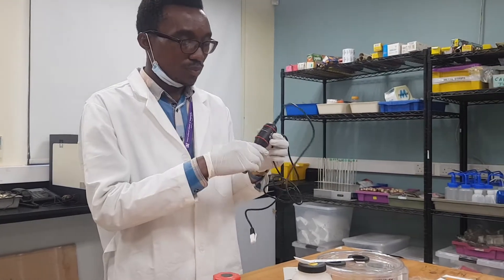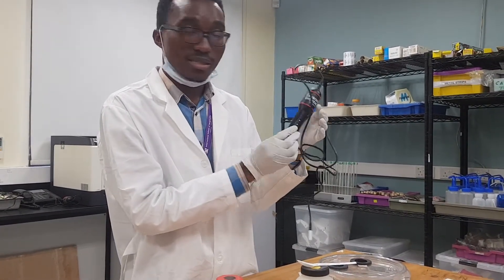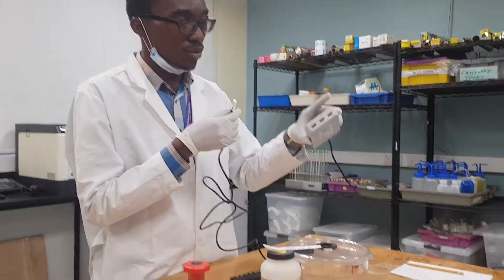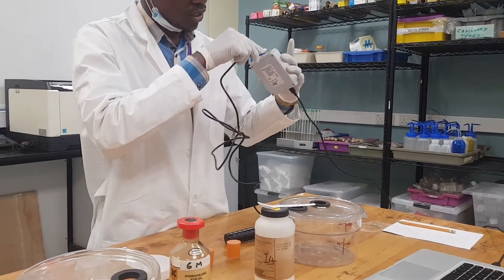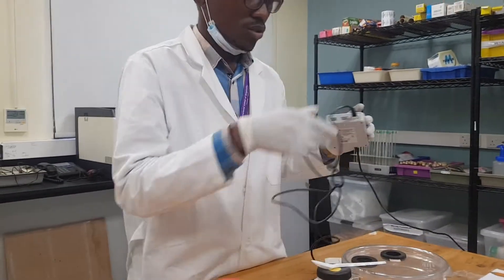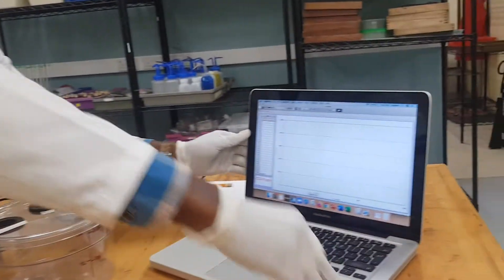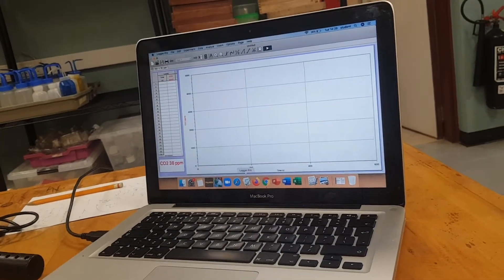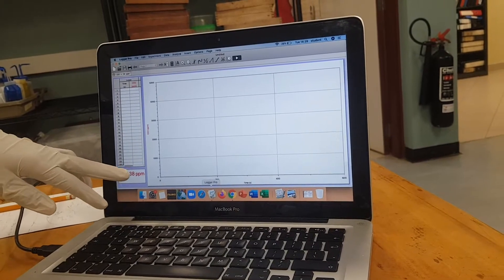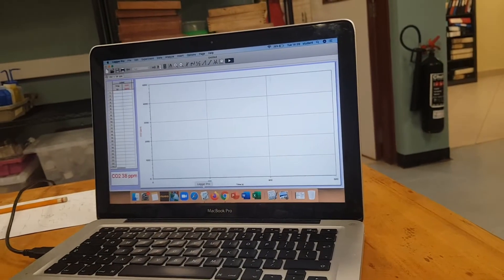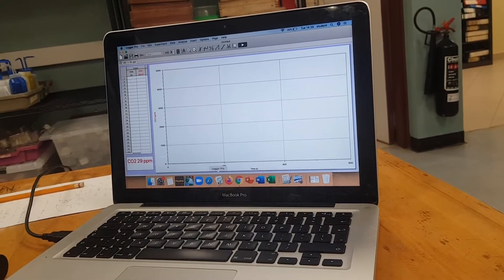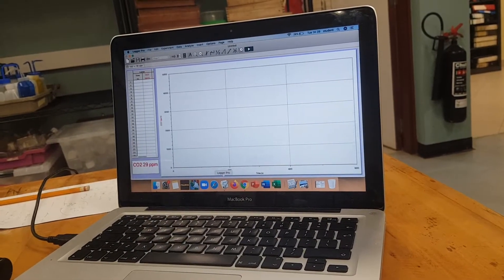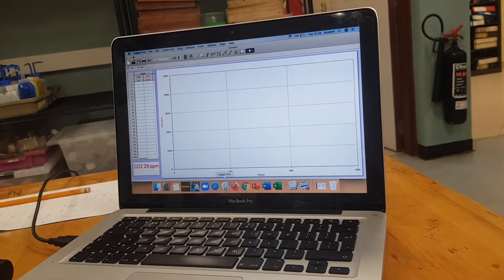For instance, you connect this carbon dioxide gas sensor. As you connect it to your LabQuest Mini, directly you see your computer will give out the readings. The readings show that in this room there is carbon dioxide, which is measured in ppm — parts per million. You can see that once you connect it, it begins to read the concentration of carbon dioxide found in this room.